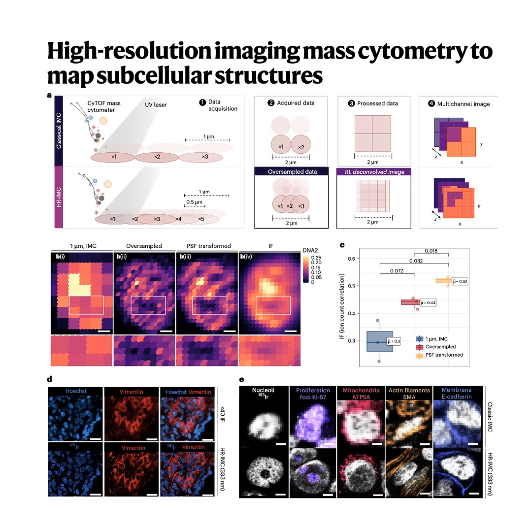But so many of the most fascinating structures, the engine room of the cell, are submicrometer. We're talking about things like individual mitochondria, which are often smaller than 1 micrometer, and the crucial dense components inside the nucleus, the nucleoli. So with that 1 micrometer resolution, they don't appear as distinct structures. They're just pixelated, aggregated smudges, or even worse, they're completely invisible. So the goal is set. Keep the amazing multiplexing of IMC, but somehow push that 1 micrometer barrier down to the nanometer scale. And do it without asking every lab to buy a brand new $1 million piece of hardware.